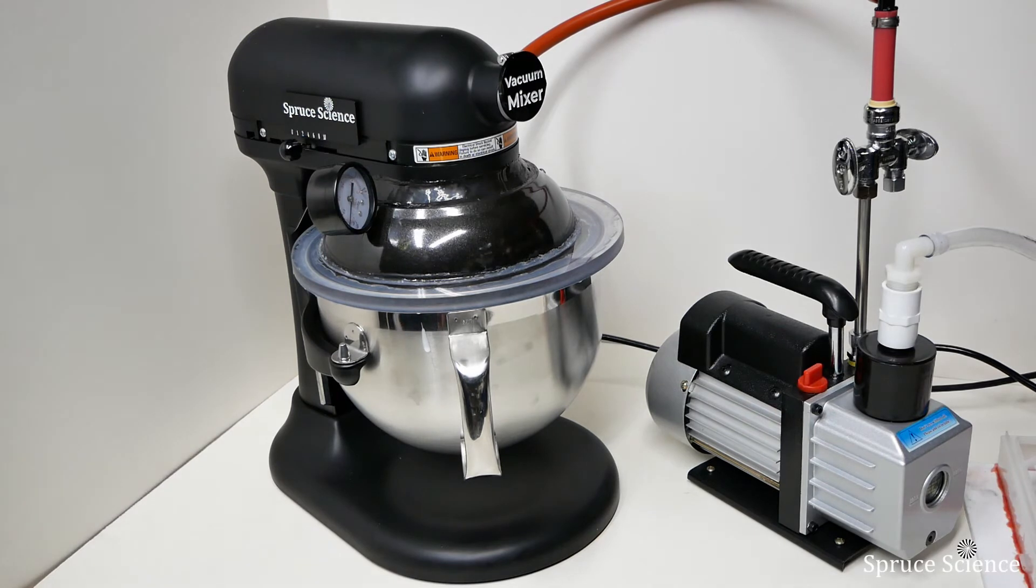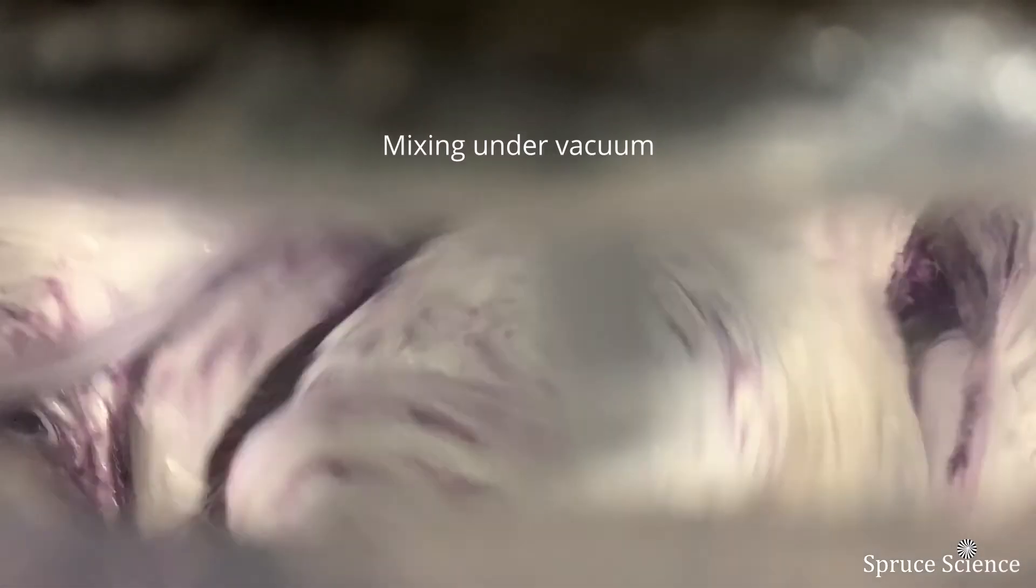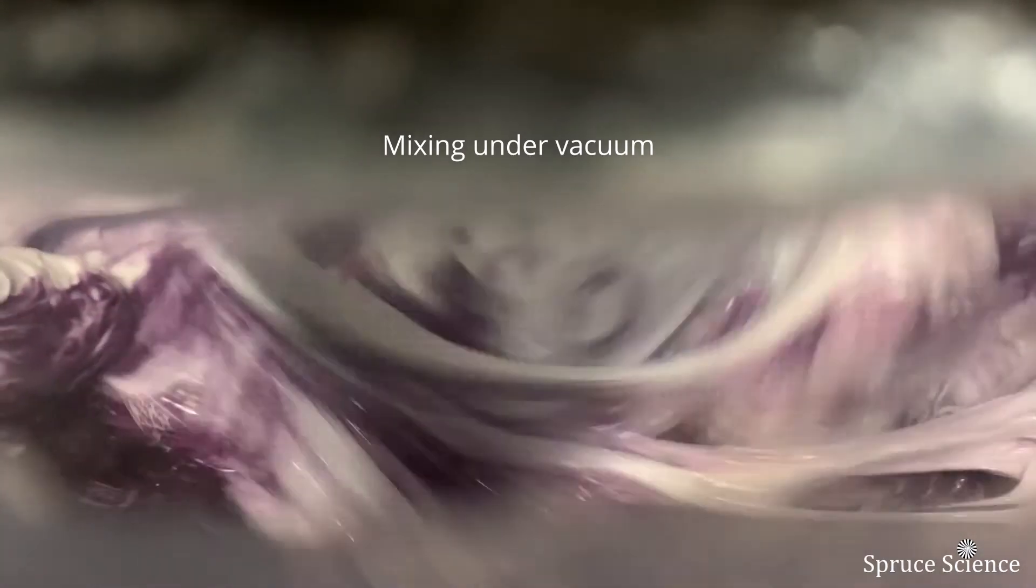The mixing bowl is pumped free of air and the mixing is carried out under low pressure in planetary motion for thorough mixing. The vacuum mixer will give you shorter processing time and increased productivity.